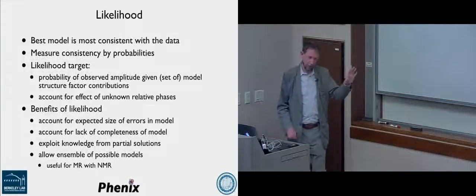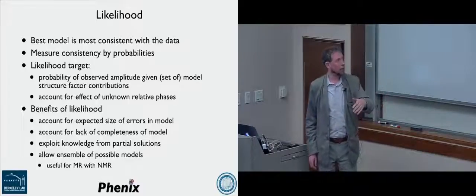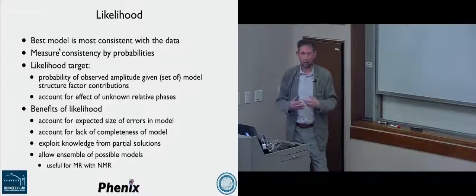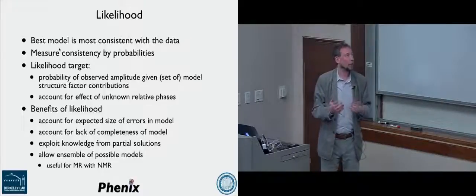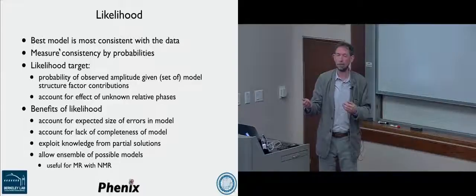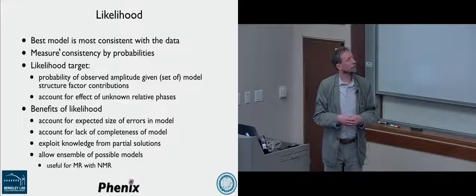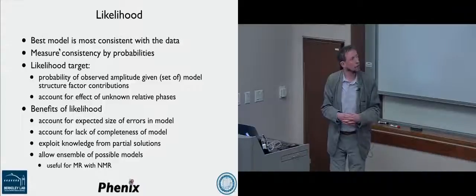So the reason to tell you that is to say a little bit more about likelihood, really. And Tom brought up likelihood, so I won't say much about it, but the good thing about likelihood is we're talking about what's the best model, or the best model is the one that is most consistent with the data, the one that predicts the data, which is sort of the opposite way around from the way we think about things sometimes. And again, the consistency is measured by probability in terms of likelihood.